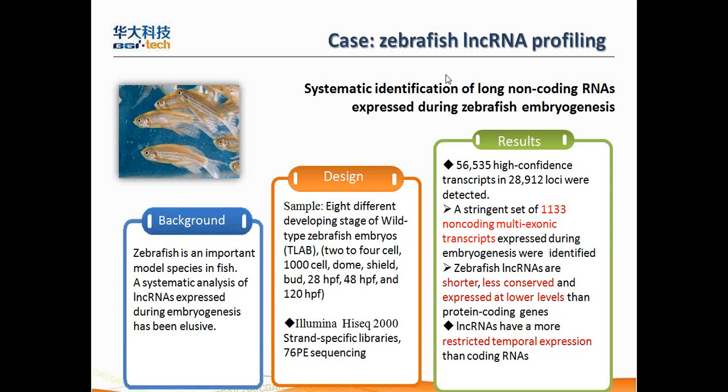This is an example of long non-coding RNA sequencing of the zebrafish. Some background information about the zebrafish. That's a very important model fish. And this investigation mostly pays attention to the embryogenesis stage.